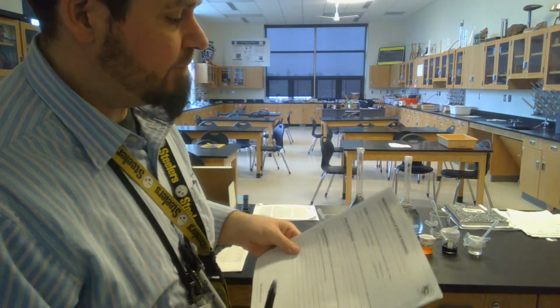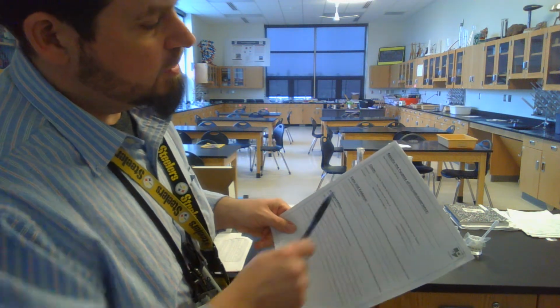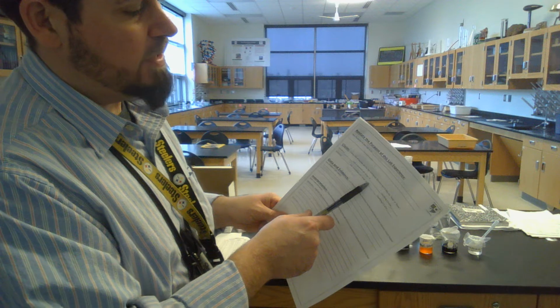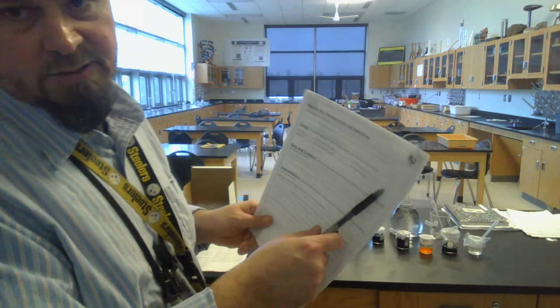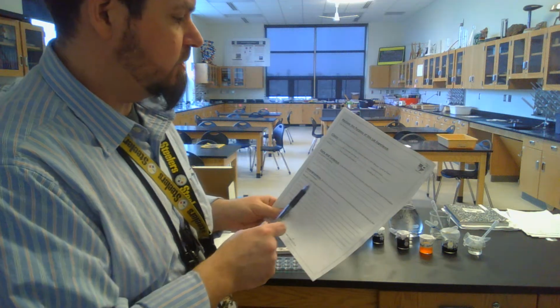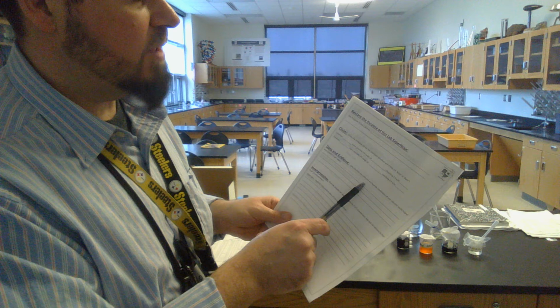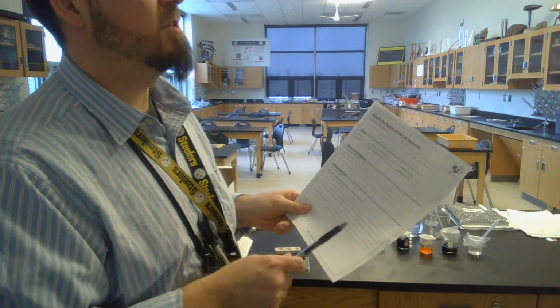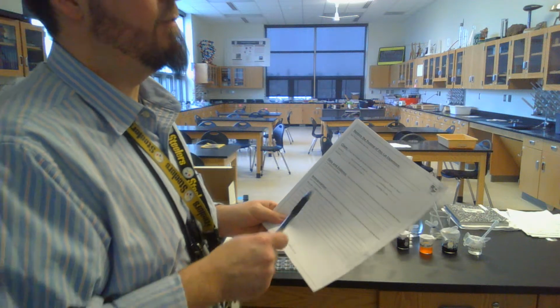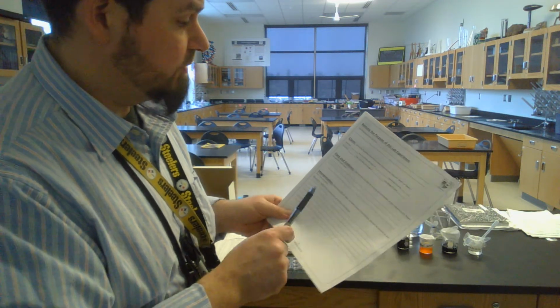And then, of course, you have your CEI, your claim, your evidence, and your interpretation. Purpose. Claim. Solution 1 has a possible pH range of blank to blank, classifying it as an acid or a base. Right? Same thing for solution 2. Cite the data you collected for your evidence. Cite the data you collected and how the combination of your indicators helped. So especially the ones that match up. If there's a flyer, you don't have to talk about that here, but the ones that match up, talk about the ones that match up.